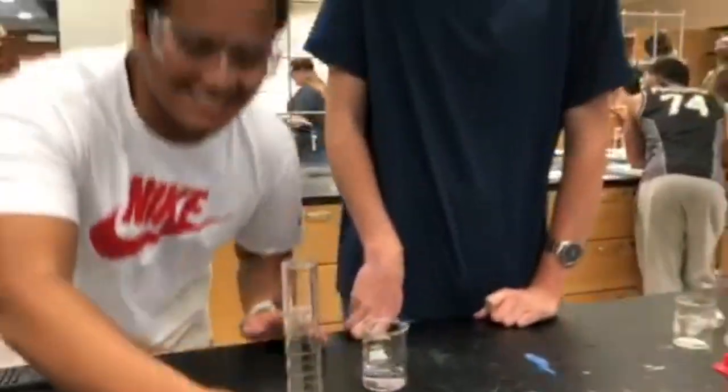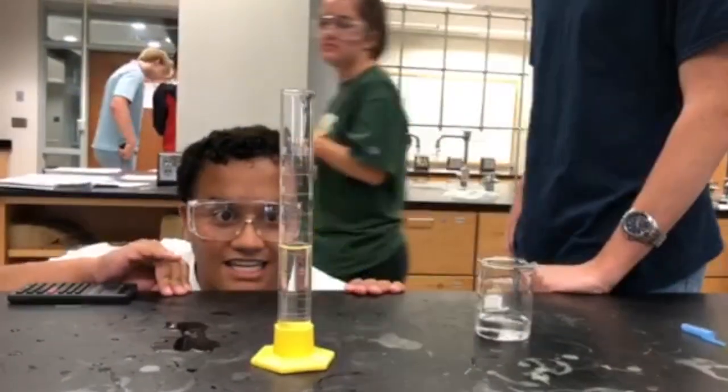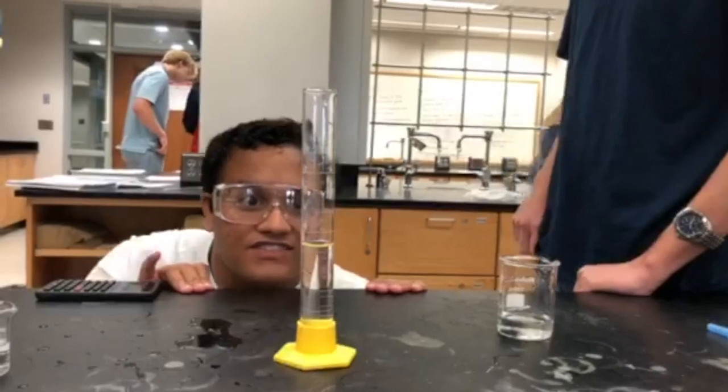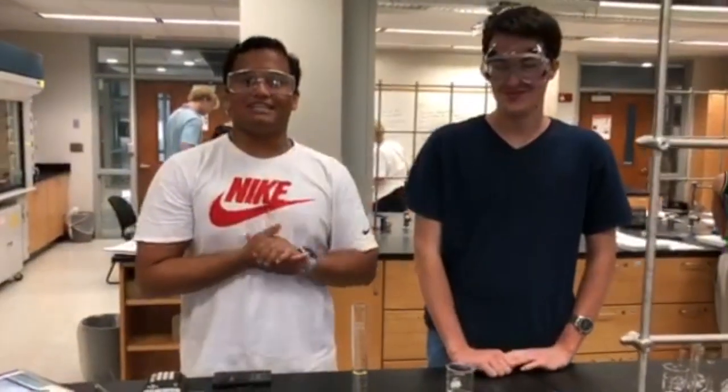And so this one, if you're measuring it, it would be 53 milliliters to be exact, measuring at the bottom of the meniscus.